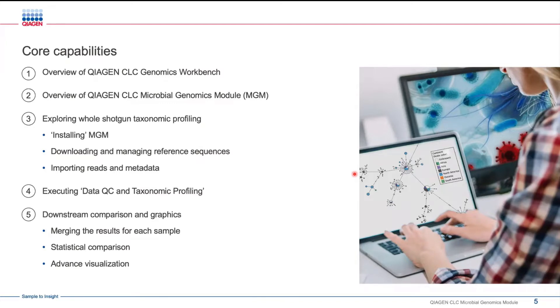Within the MGM module, we're going to explore whole shotgun taxonomic profiling. To do this, we're going to go through the installation of the MGM because it is a plugin, talk about how we can easily download and manage references within the workbench specifically for taxonomic profiling, and then get the data into the application — reads in the form of FASTQ and metadata.